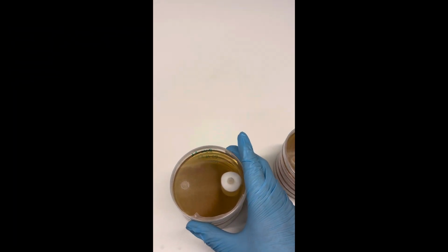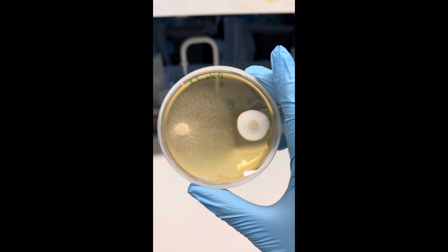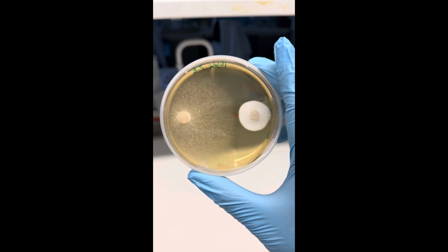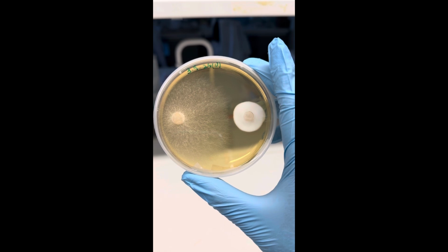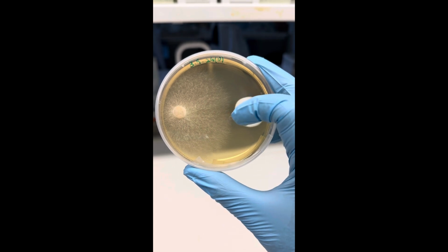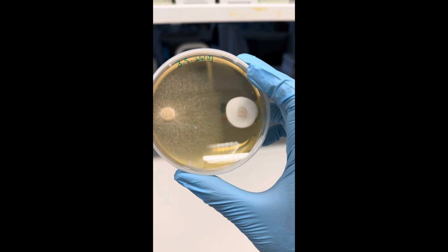But it's interesting to see, if you can notice here, that there is a gap between the threads that you can see on the left side and the very bright white species on the right, which is growing in a circular form. So there is this gap I'm talking about. You can see that there is something going on.